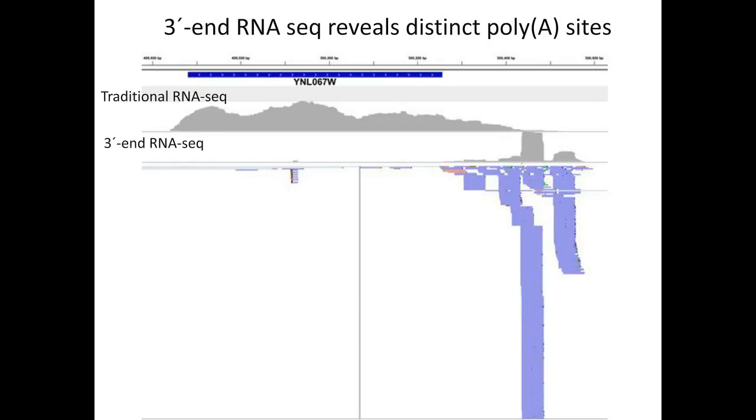So using the nuclear exosome targeted poly-A tails as a signature of these roadblocks, we found on the order of 700 roadblocks genome-wide if we consider a cutoff of 1 read per million. And so these roadblocks were found upstream of these Reb1 DNA binding sites as well as the TFIIIB binding sites. In addition to those two factors, other DNA binding proteins were also identified in our study.